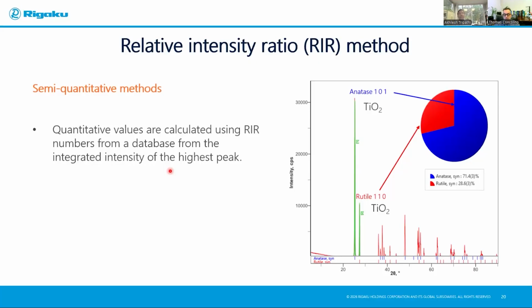So if this gives you some sort of an idea, that's how this technique originated. But these days, modern computers can, of course, find the integrated intensity of the peaks by just measuring the peaks, and you are using a relative intensity ratio with alpha alumina. But that's the origin of this method, which I have seen myself visiting a long time back.